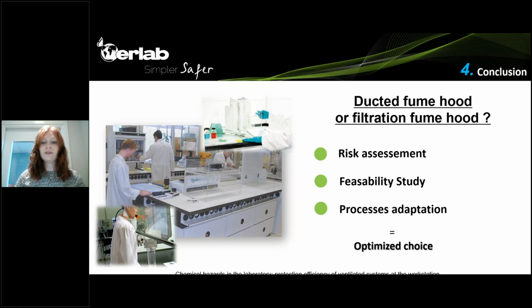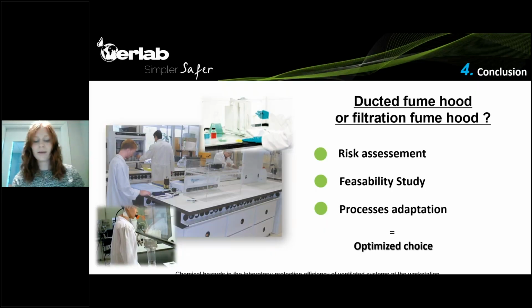Then a feasibility study, checking what is the best option and understanding what is going to be done under the fume hood, and then some process adaptation will make the optimized choice. And now I am done with the presentation. I hope you enjoyed it, and I am open for the questions now.